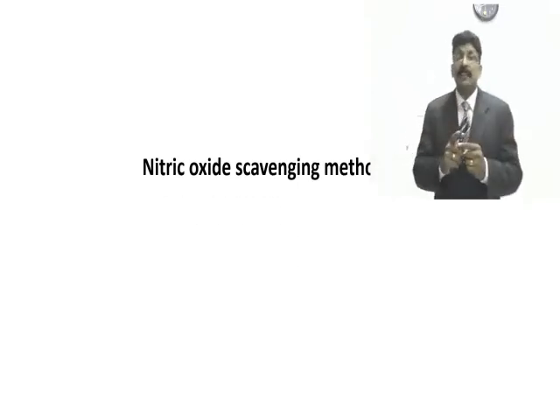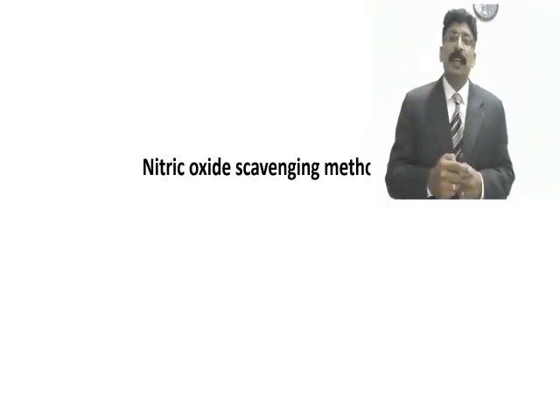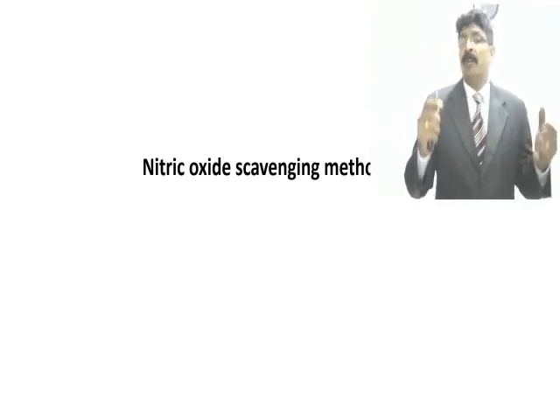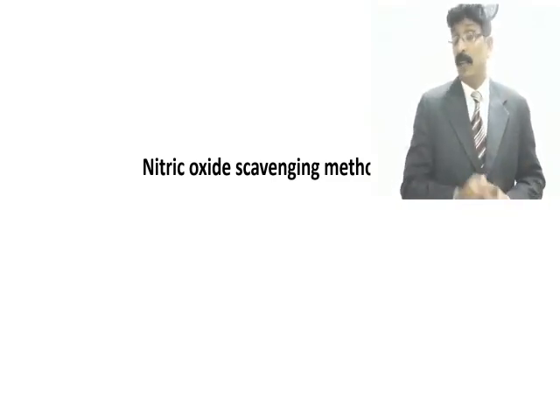And if possible, I was thinking to explain another method, the nitric oxide scavenging method. I don't know how far it is useful. Anyhow, I tried my level best to make you understand how to calculate IC50.